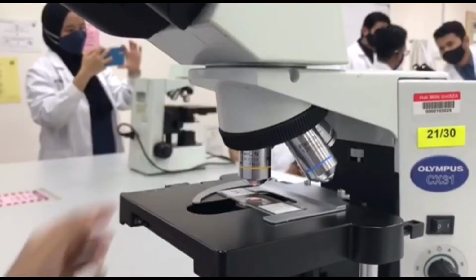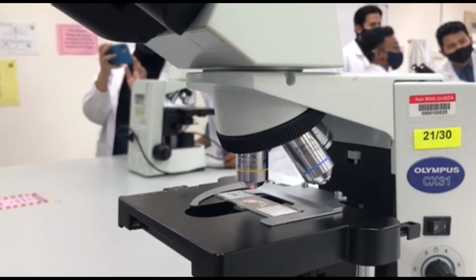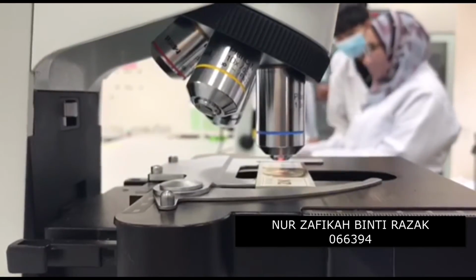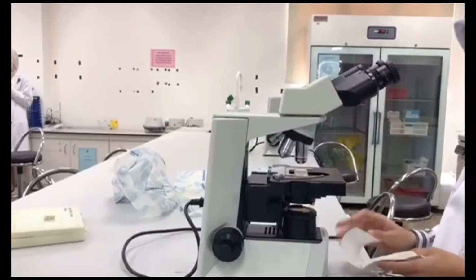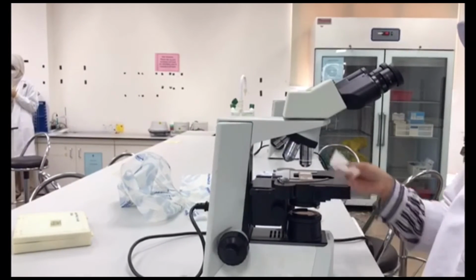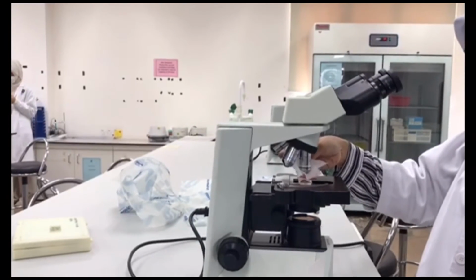Focus on low power and then switch to high power. Make sure the lens doesn't touch the slide that you are looking at. Only use lens paper to clean the lenses of the microscope, and if using immersion oil, always ensure the objectives are cleaned immediately after use.